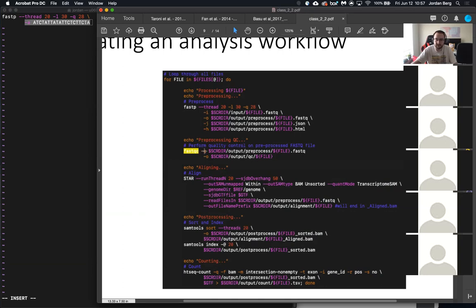And so with this, you just tell it what's the FASTQ file that you want to be running. So we want to grab the FASTQ files from the pre-process folder, and then we will output these to that QC folder, and we'll just use the file name or the sample ID as the file name there, and then it'll automatically append the suffixes that it needs there.